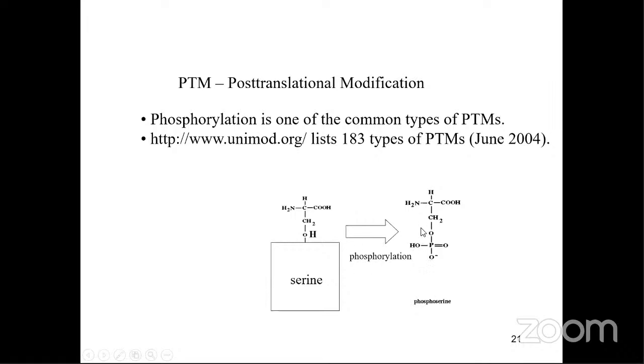So it attaches a phosphoryl group here. Okay, why is it doing that? It helps the fragmentation in the mass spec much better. We'll talk about that later.